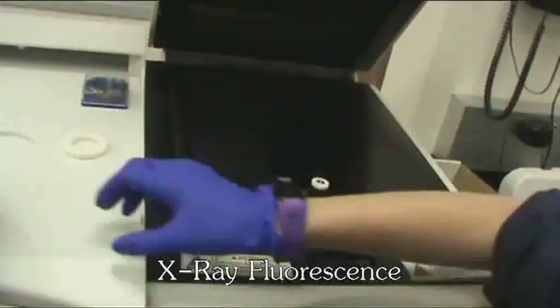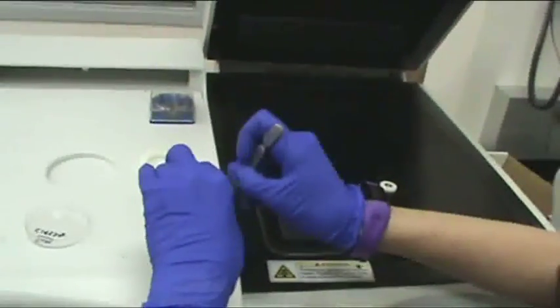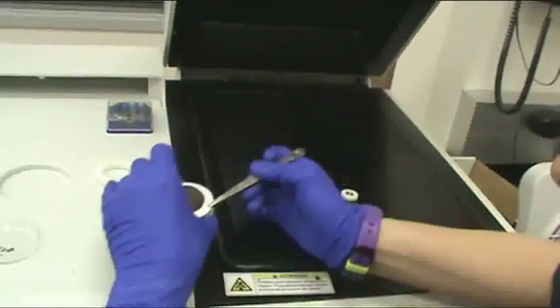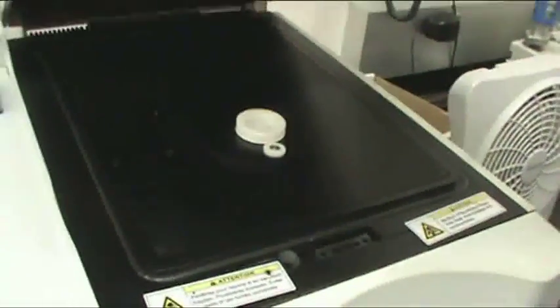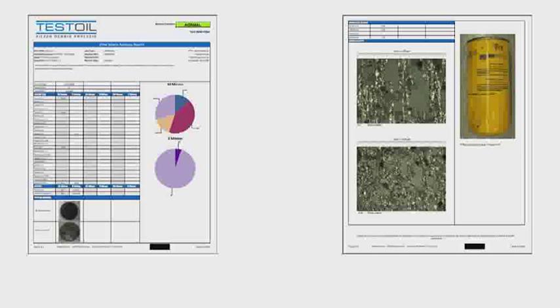Lastly, in the filter debris analysis process, the 5-micron and 30-micron patches are analyzed with the X-ray fluorescence machine, also known as the XRF. The XRF can determine the range of elements present as well as the proportions within the sample. Once testing is complete, the data is assembled in a report. Our analysts review the data and conclude an appropriate determination of your machine's condition.